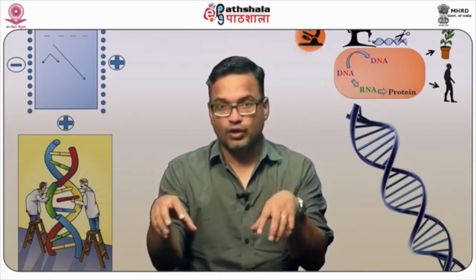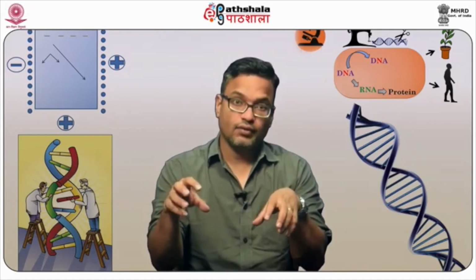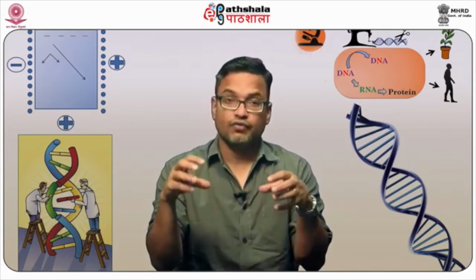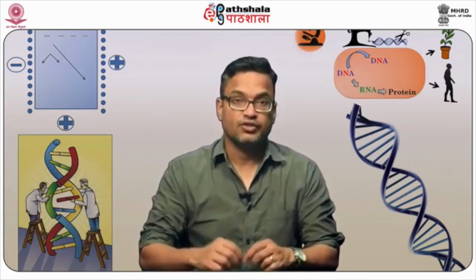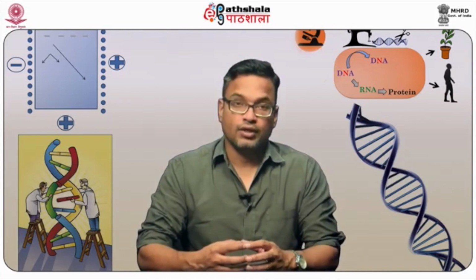Also, by labeling two different molecules which we think may be interacting, we can test whether they are interacting or not, and if we know they are already interacting, we can visualize it by tagging the two molecules and viewing them under the microscope to see that both signals are coming from a very close vicinity. That means those proteins are interacting. These are a few applications that are also done using this method.